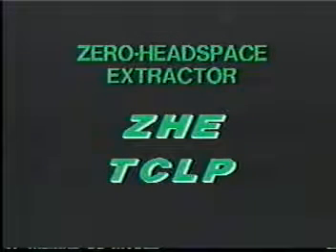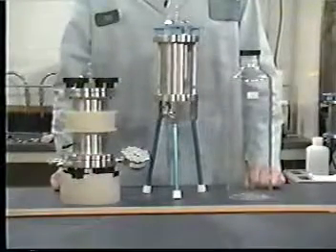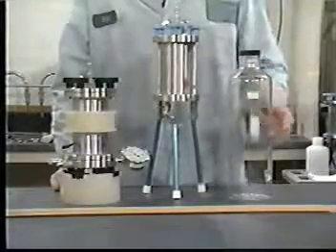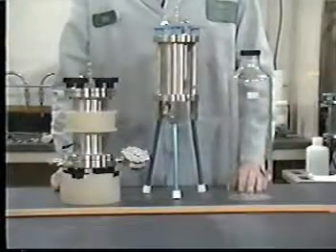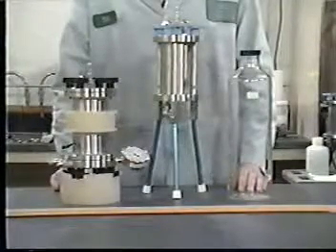We will now demonstrate the zero headspace extractor, or ZHE TCLP. This is the procedure to use where volatiles are of concern. The ZHE should be used only for extracting volatiles and is unsuitable for non-volatile analytes. The ZHE has an internal capacity of about 500 milliliters, much less than the device used for the bottle TCLP. This means that it can hold only 25 grams of solid during extraction, due to the need to use 20 times that amount of extraction fluid.